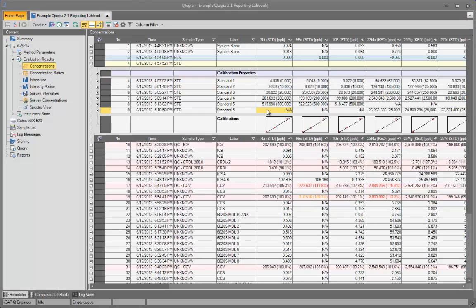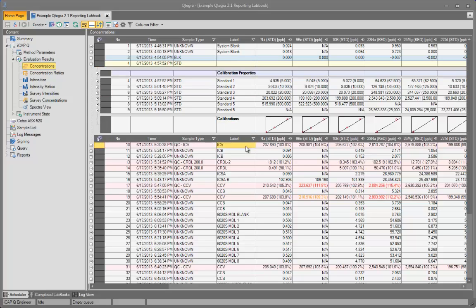This is a typical labbook with initial calibration color-coded here in yellow with its associated blank color-coded here in blue. After the calibration, a series of unknowns were analyzed and interspersed among them were a series of quality control samples, here color-coded in red.